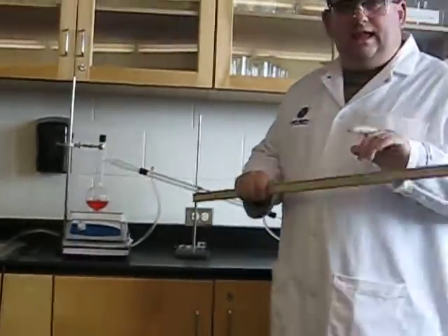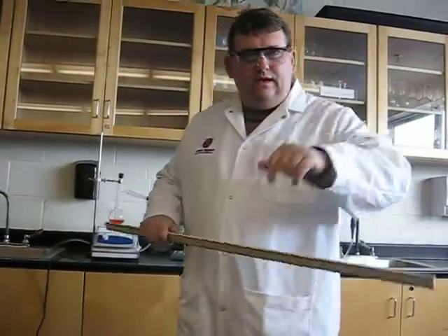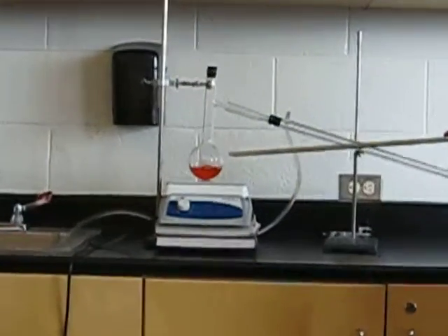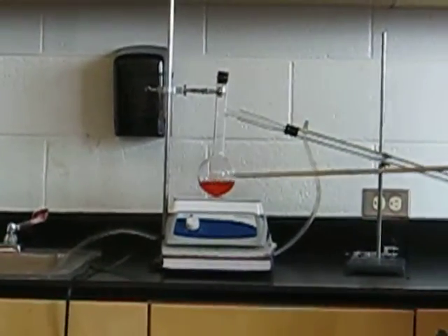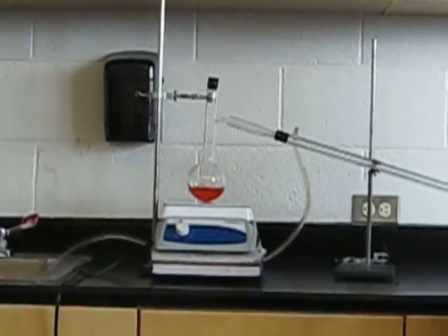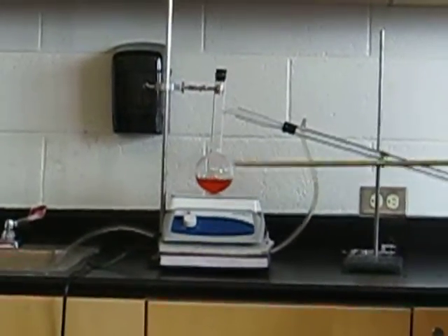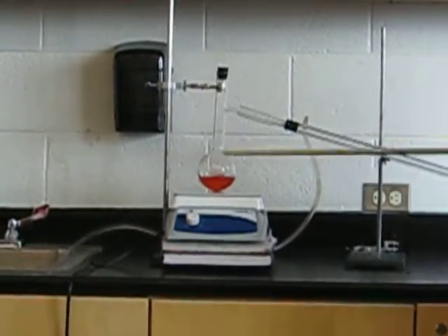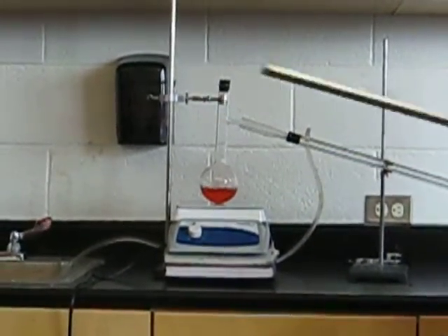The process of distillation is two steps. Step one, evaporation. In our flask, we have some nice orange Gatorade. As the Gatorade heats and boils, as we see here, it is boiling by the bubbles, and if we get a close-up of the flask, we will see the bubbles going up and down.